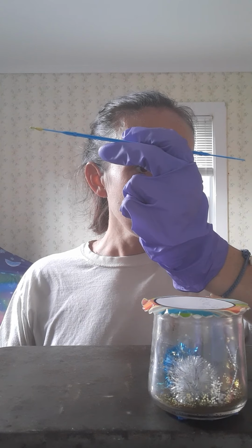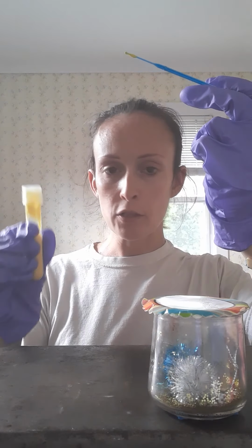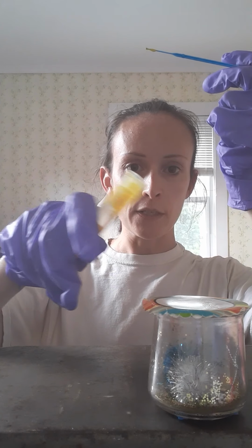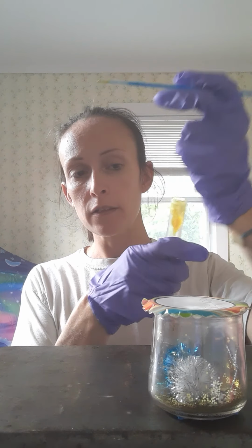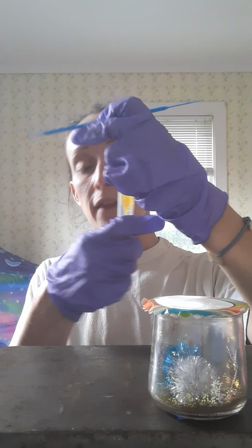And then incinerate it. My apologies. So when I would open this, let me do that again. So I would open it, I would incinerate that before I put the loop in, and then I would put the loop in, pull it out, incinerate it again, and then do that.